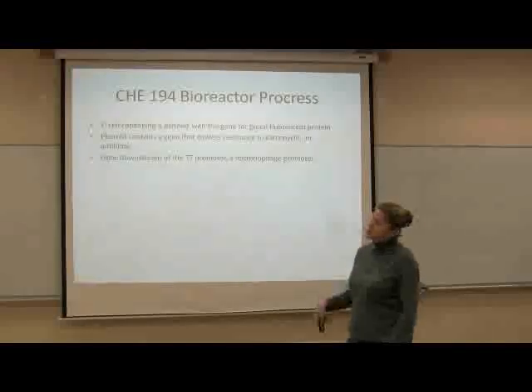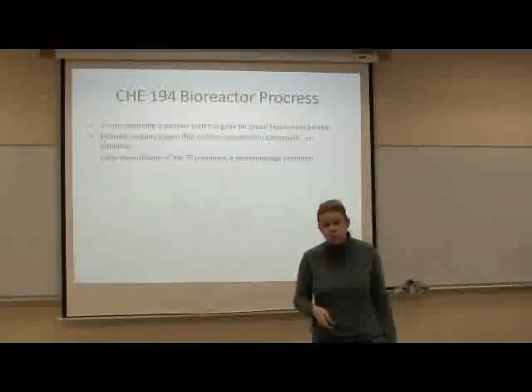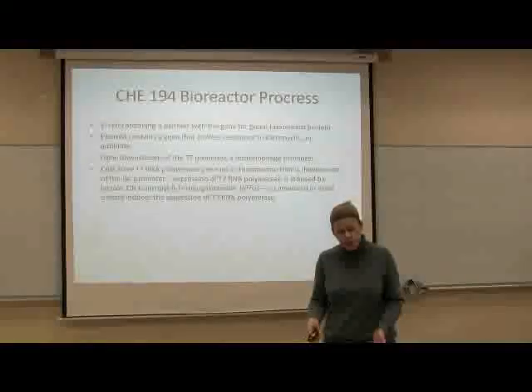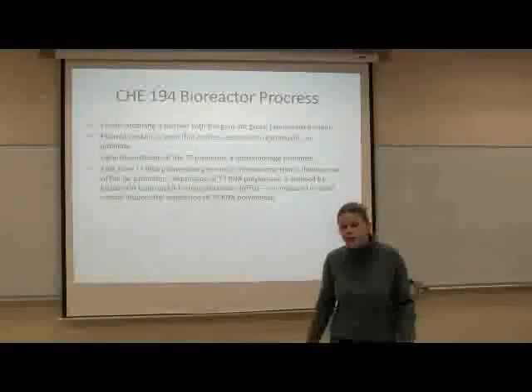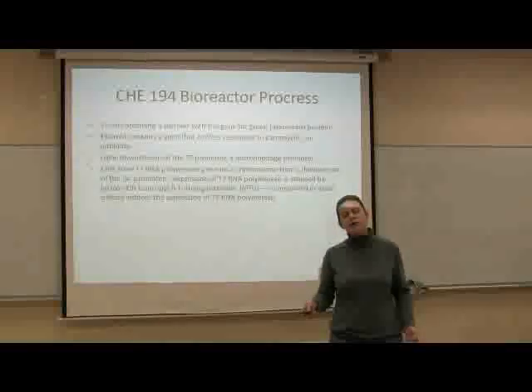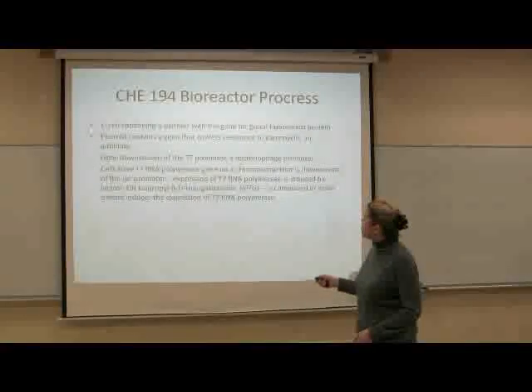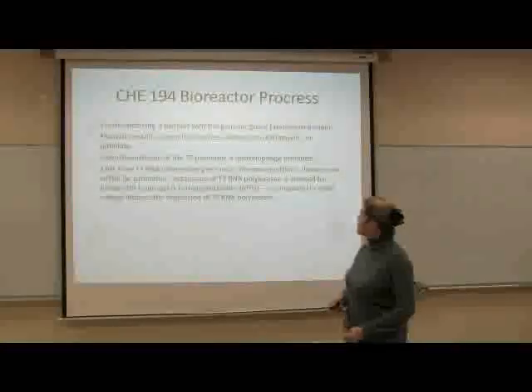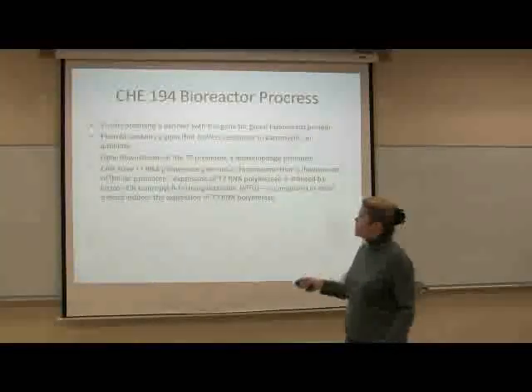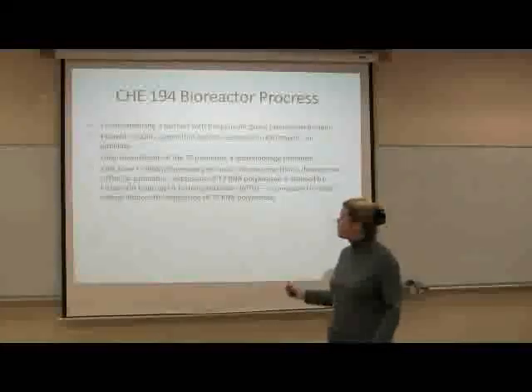So in terms of the inducer, the gene for green fluorescent protein is downstream of the T7 promoter, which comes from a bacteriophage. I hope you know what a bacteriophage is. But it expresses a lot of protein, and in order to express it, it needs the T7 RNA polymerase. And this bacteria has the gene for the T7 RNA polymerase downstream of a LAC promoter, which means that lactose, or isopropyl beta-D-thiogalactoside, which is a lactose mimic, will induce it, and it won't be consumed. So if you put some of this in there, it stays there. It doesn't get eaten up.